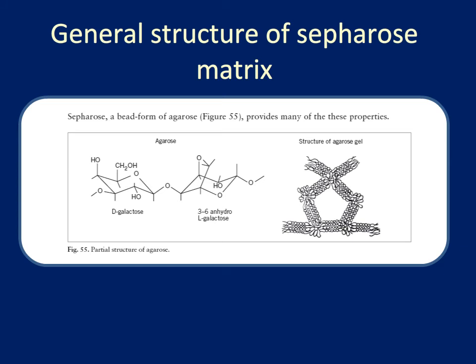This mini lecture has provided you the basics of affinity chromatography. It has described the practice of using fusion tags to direct an affinity and the process of utilizing the properties of a particular protein and designing a resin that is specifically targeted to a protein property, such as a substrate or cofactor.